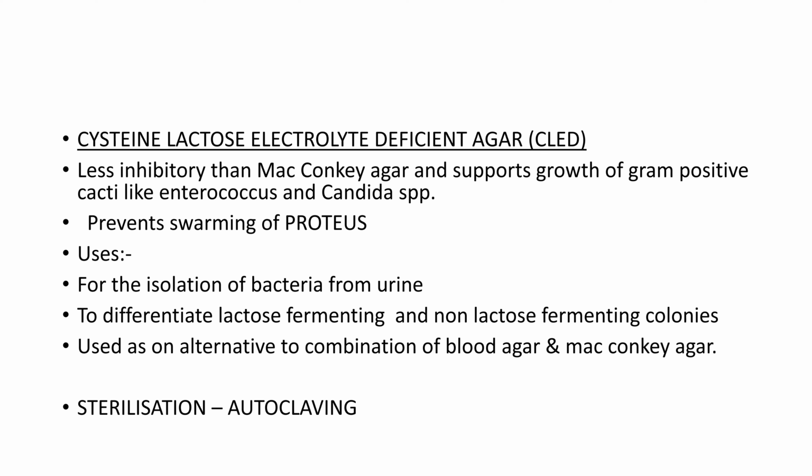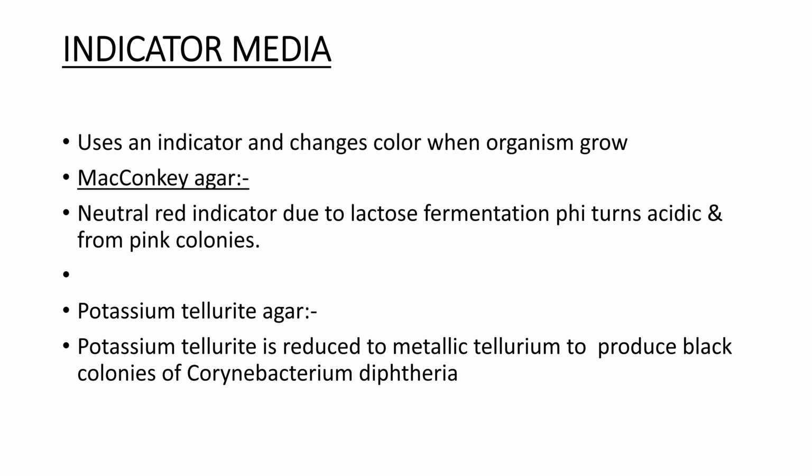So now the uses: I have already mentioned that it is used for the isolation of bacteria from urine. It helps to differentiate lactose fermenting and non-lactose fermenting colonies. It is used as an alternative to the combination of blood agar and MacConkey agar, and the sterilization is done by autoclaving.